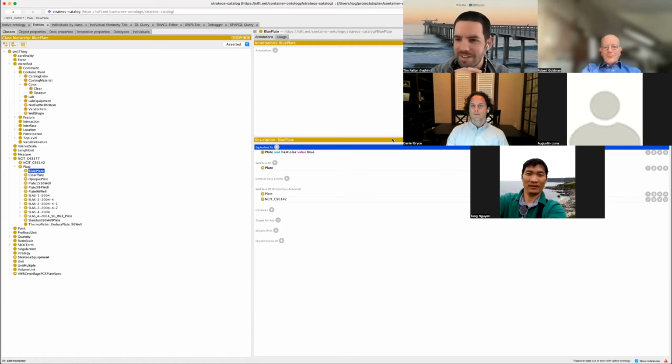So Robert, I do have a question. I was trying to write it down, because maybe if I say it out loud, it won't be as clear, because I am coming more from the biology side, trying to take a pragmatic view of things. So it seems to me that this captures both ontology considerations, as in categorization of things, and it's also acting as a database in that each instance, in its ideal form, would capture all catalog numbers for all plates that are out there.